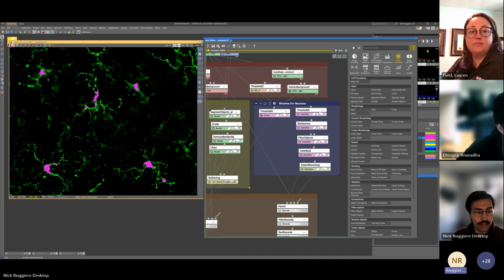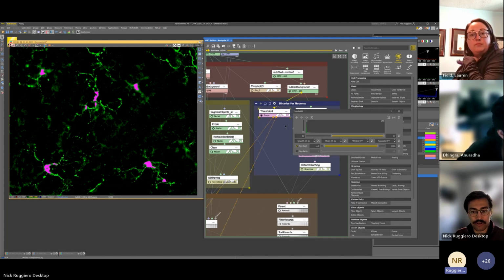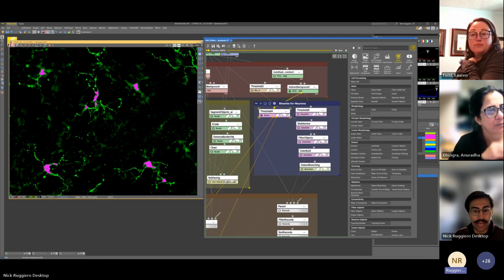We'll increase the opacity there. These images are pretty overexposed, so I'm not sure exactly what's going on here and the exact area that we're interested in. But because they were a little bit overexposed, they were pretty easy to threshold out. And that is a pretty straightforward threshold. I thresholded out the bodies.